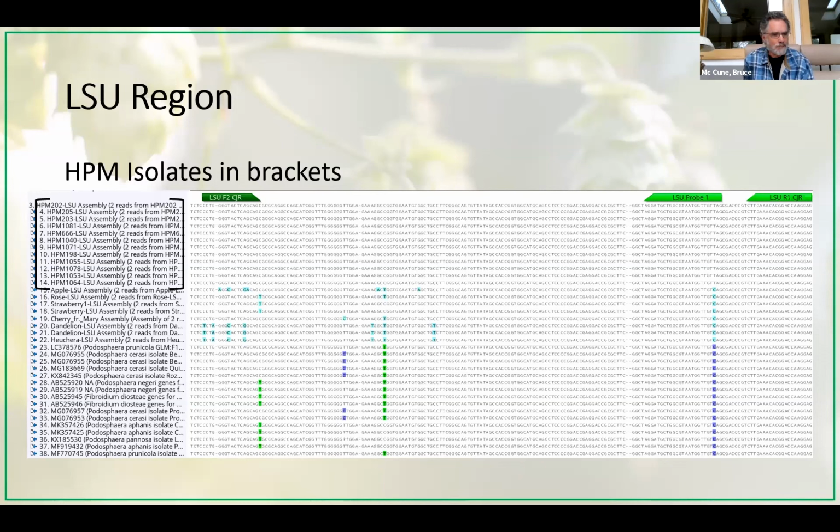And I thought, well, you're getting lots and lots of samples, and I don't think qPCR is probably the way to go to find, you know, a single ascospore that came over from the coast. But what do you think? Is there potential for reusing your DNA extractions for basically detecting rare events?